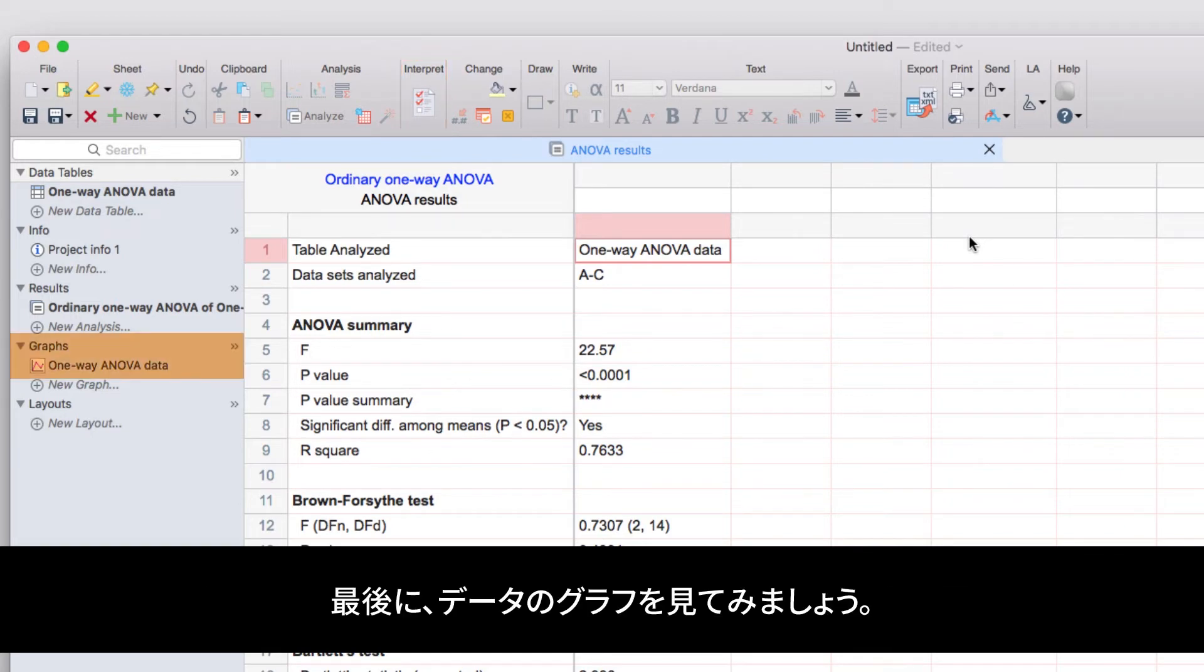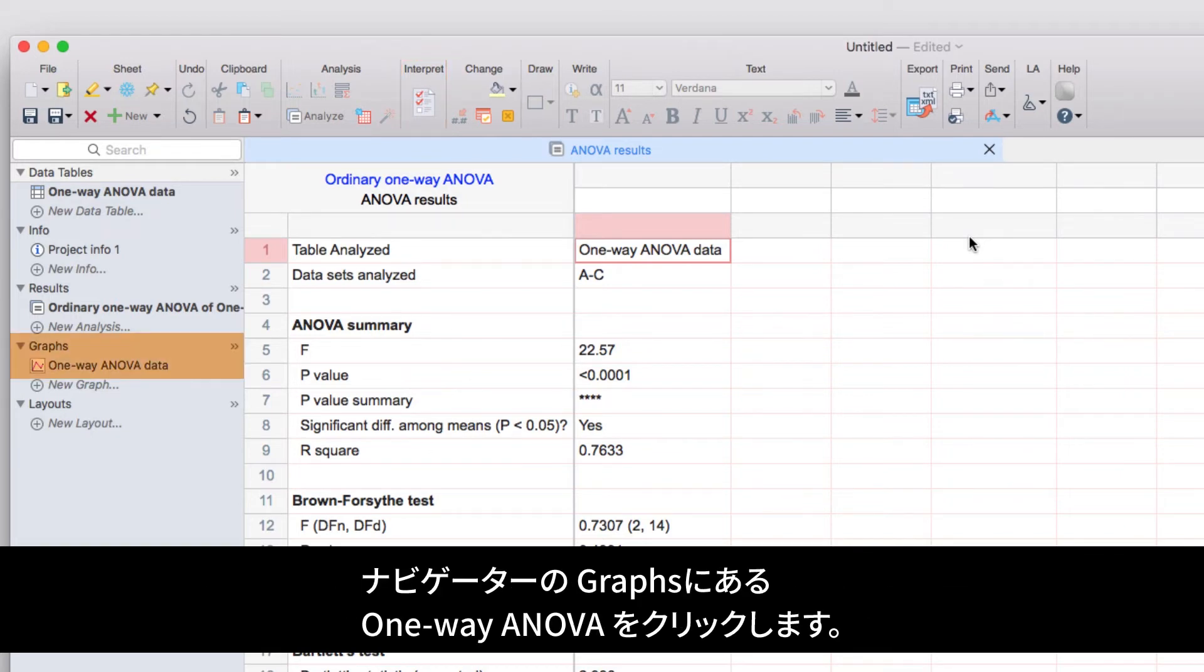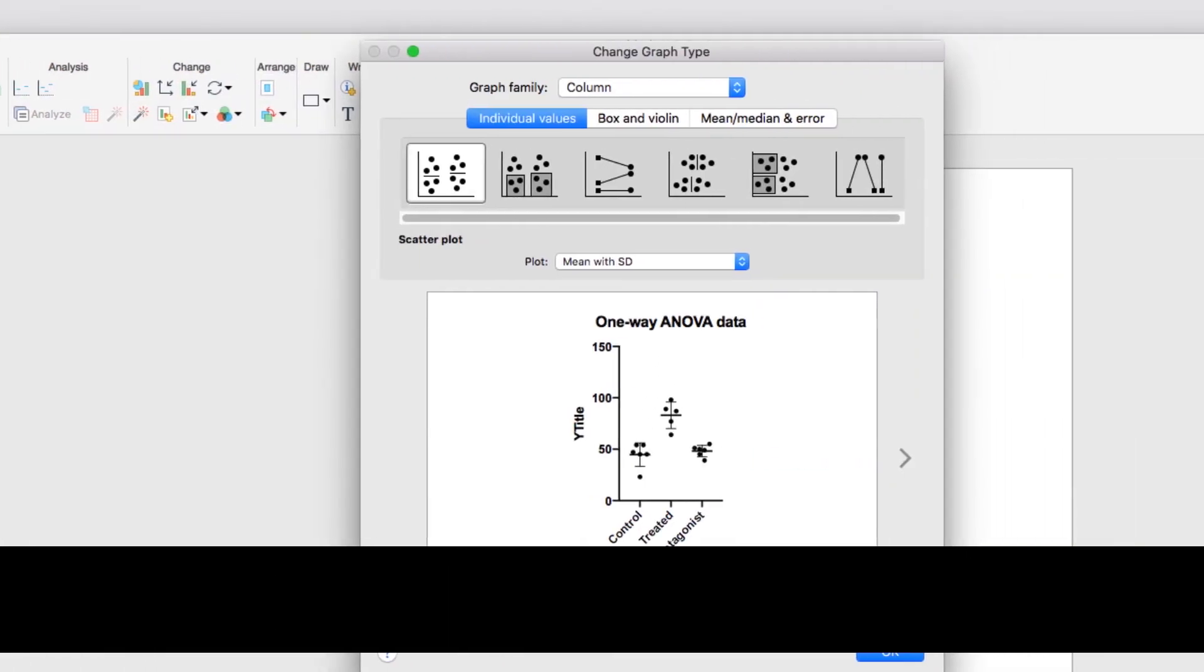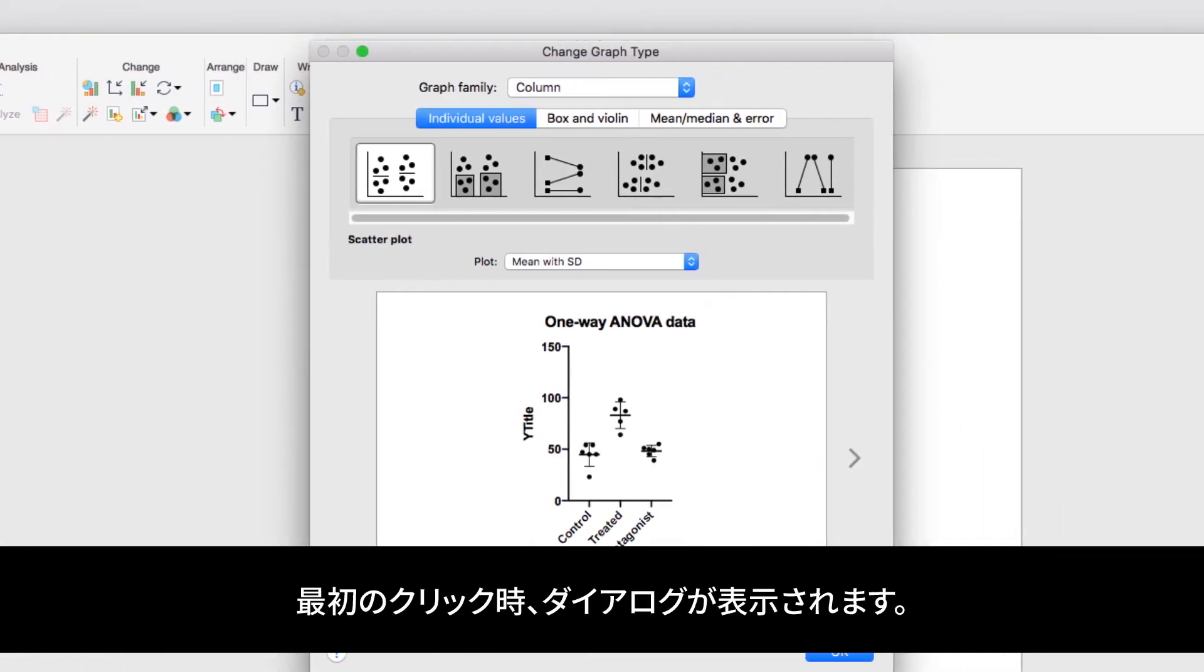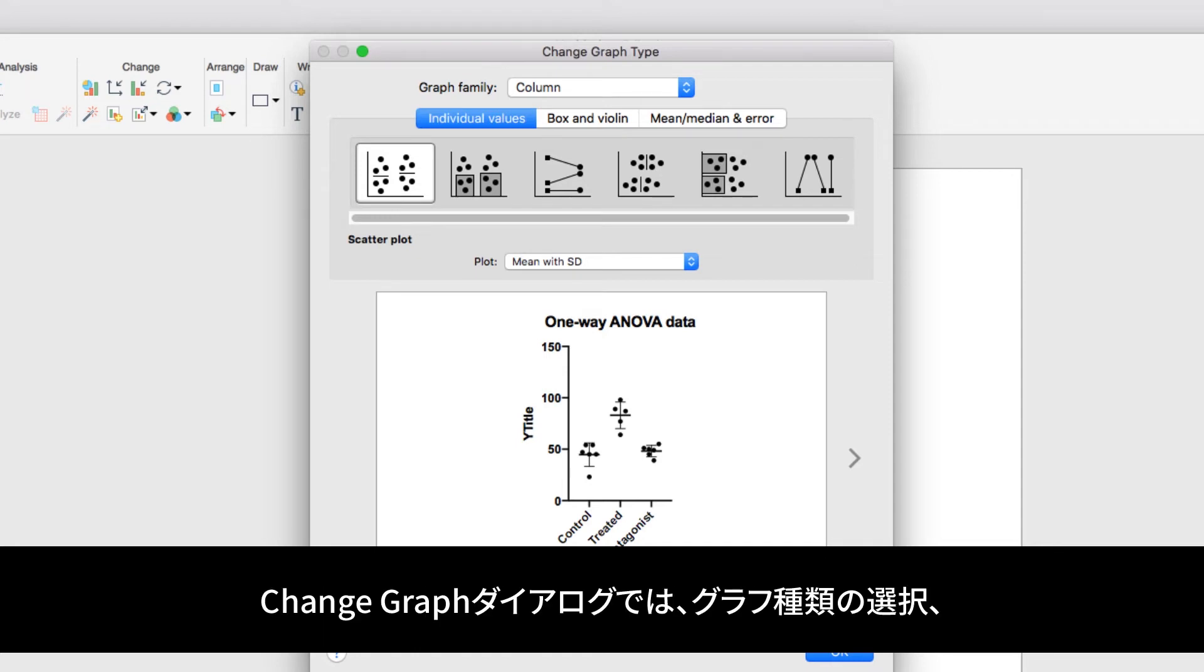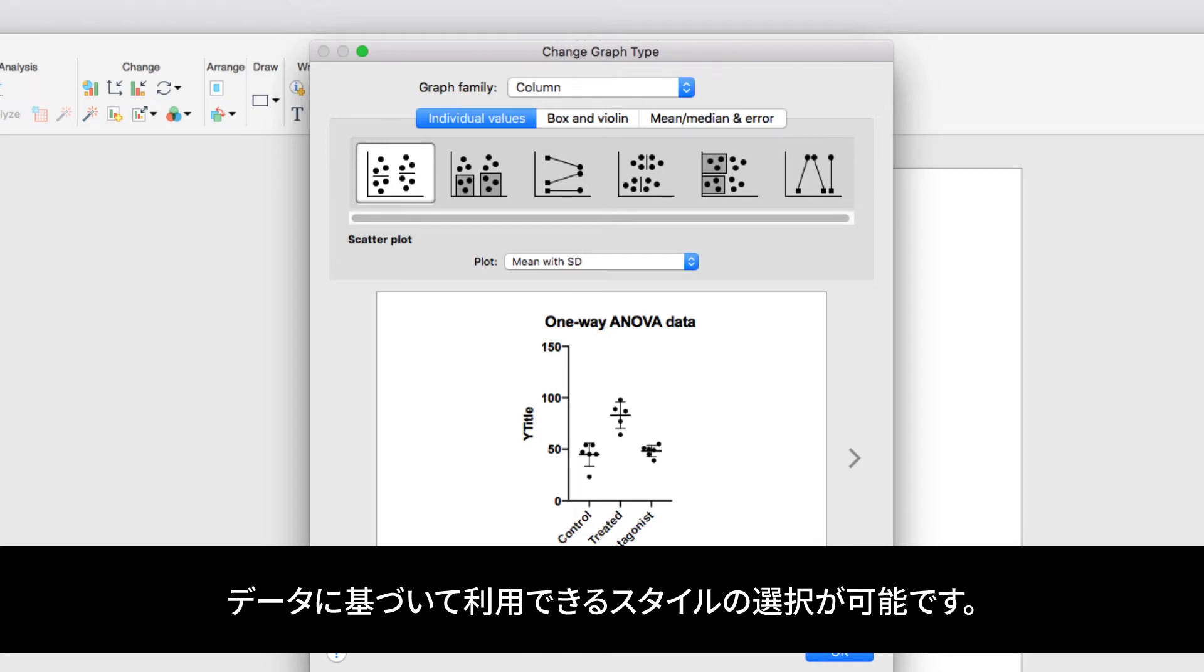Finally, let's look at the graph of our data by clicking on the graph sheet for One Way ANOVA in the Navigator panel. The first time you navigate to a graph, the Change Graph dialog will appear. This allows you to select the kind of graph you'd like to use for your data and shows a range of available styles based on the type of data table your data are in.